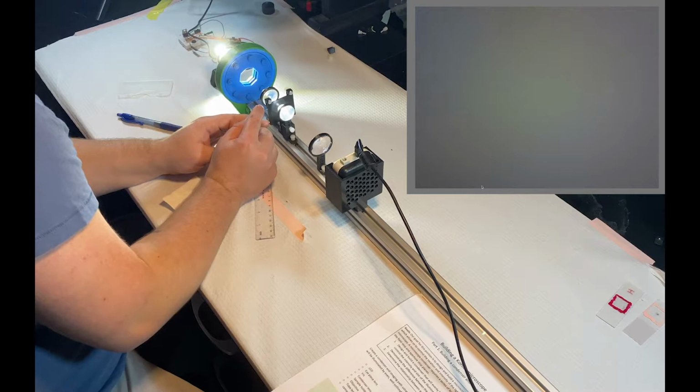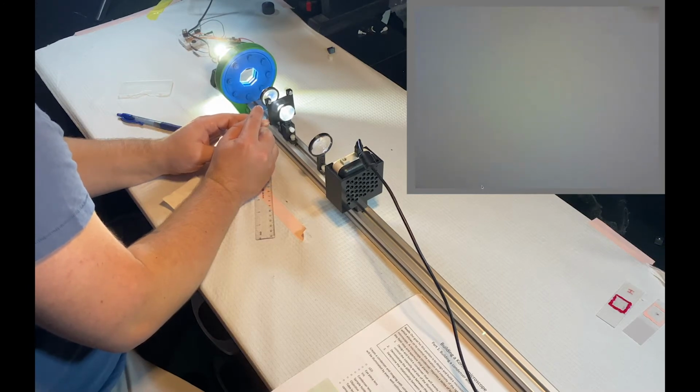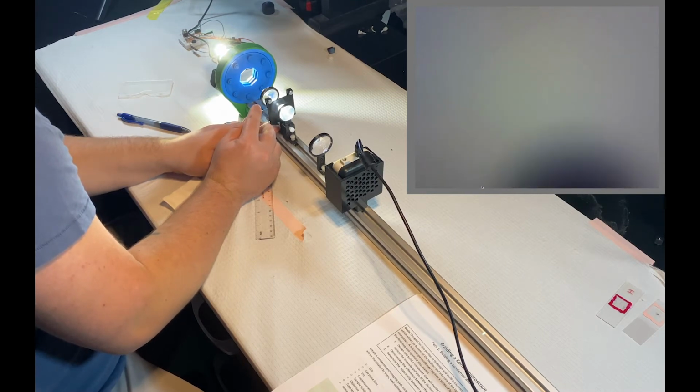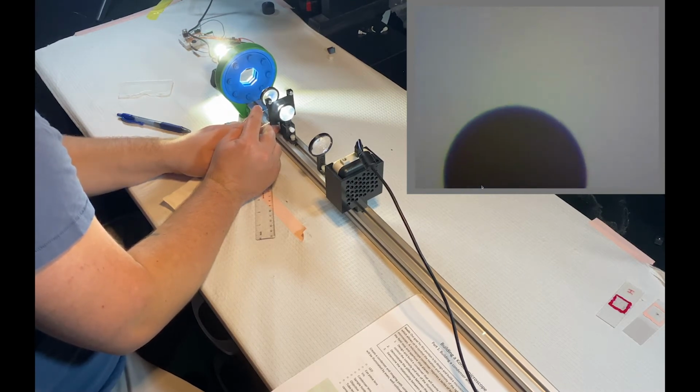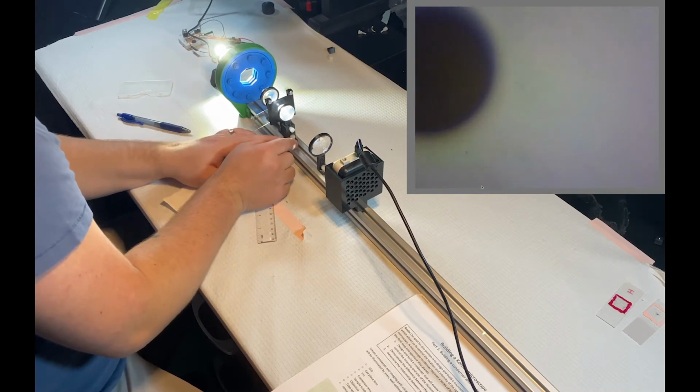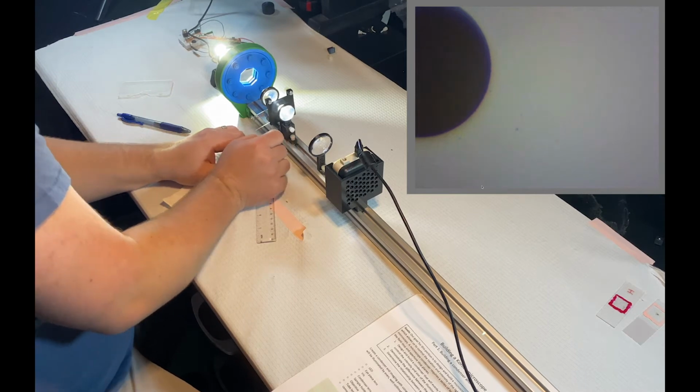We'll make sure that this dot is still visible. Small adjustments to our objective lens. That looks pretty sharp to me.